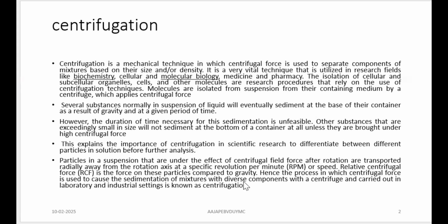Now all these things tell you that this particle will get separated when the revolutions per minute is so many thousands for so many minutes. That is how we express it, right? Revolutions per minute. That is the speed of the centrifuge. That is another factor. Now, how do we count that?